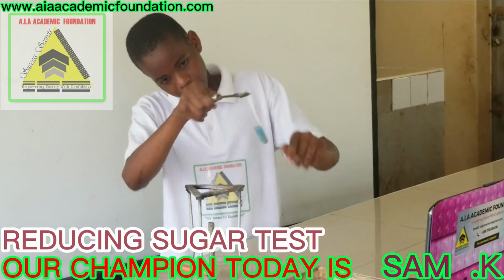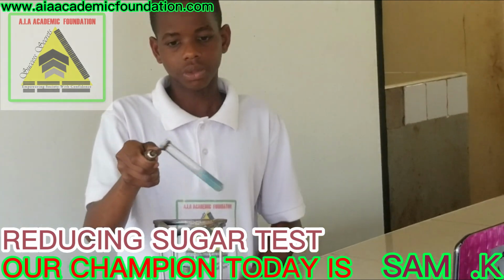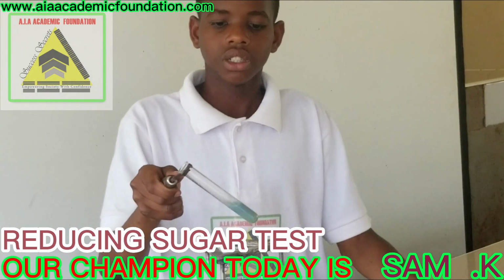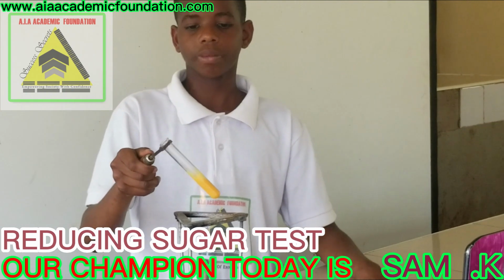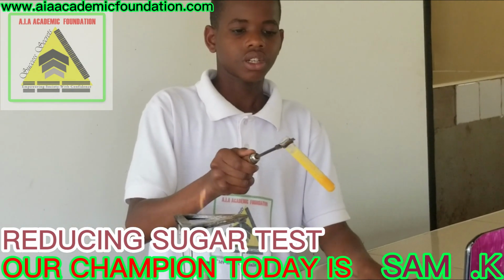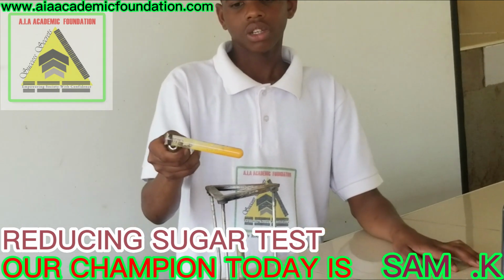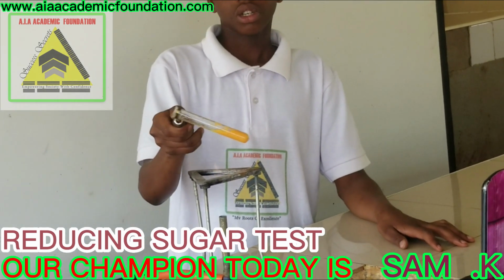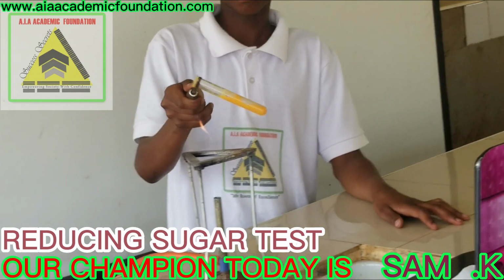So now, as you can see, it's starting to turn to a green solution. As you can see, it has now turned to a yellow precipitate. Then from a yellow precipitate, it has now finally turned into an orange precipitate.